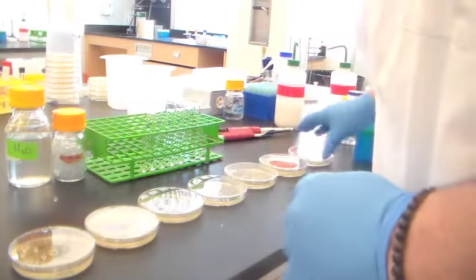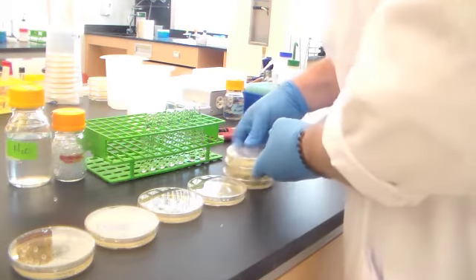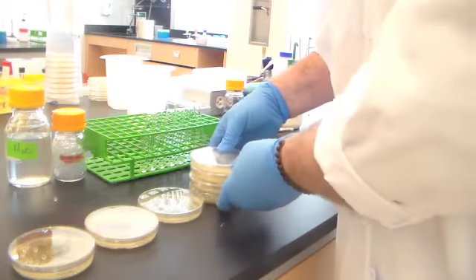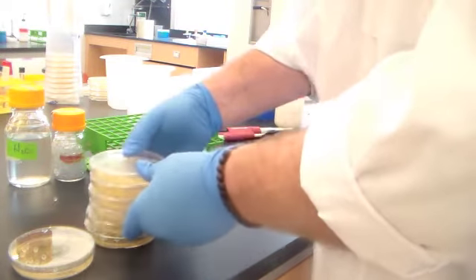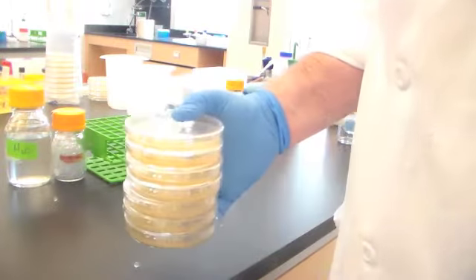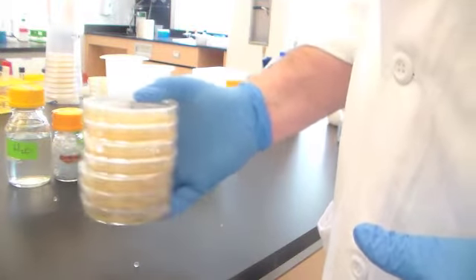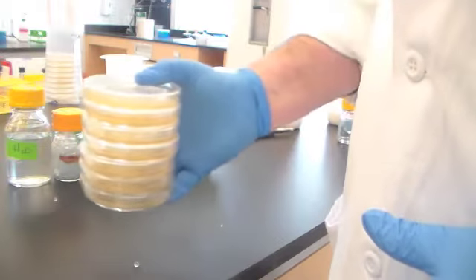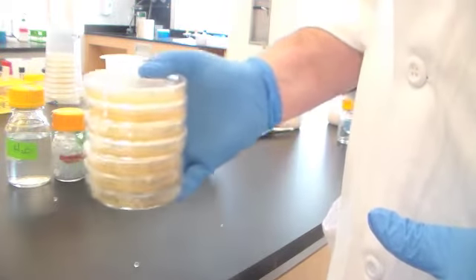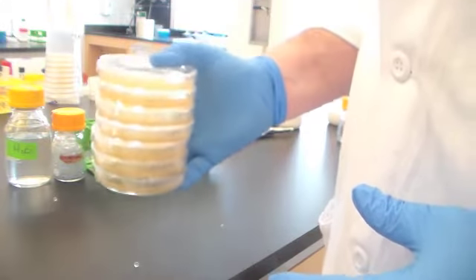Now comes the fun, almost musical portion of our program. I'm just going to stack these up. Perhaps we can turn some music on in the lab, because now what you want to do is to use those beads to distribute that bacterial culture evenly across the plate. So having 7 plates to do this with about 10 beads per plate gives you a nice percussion.